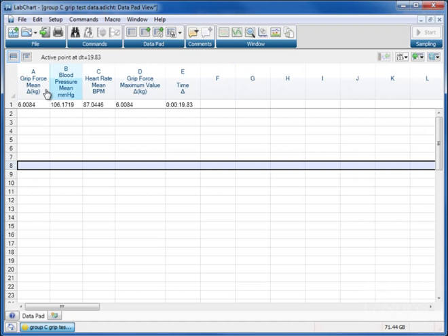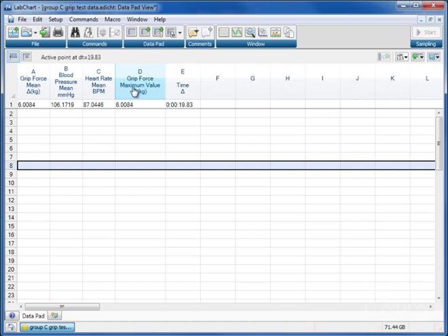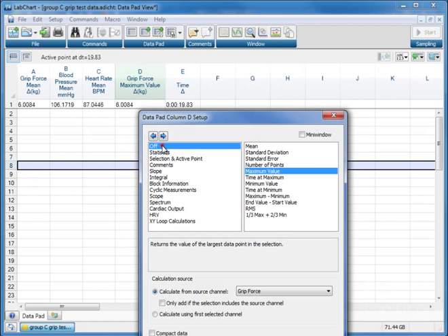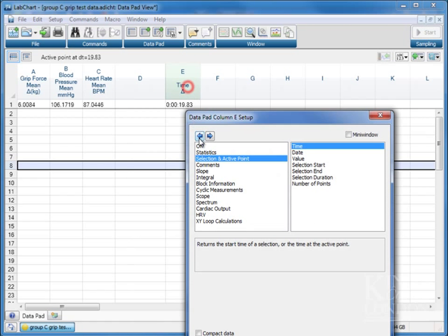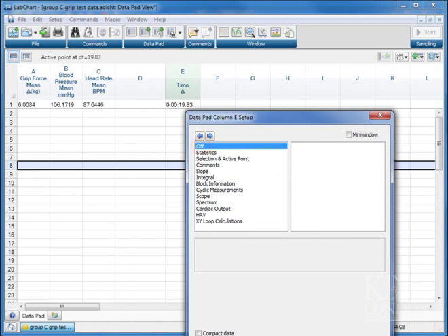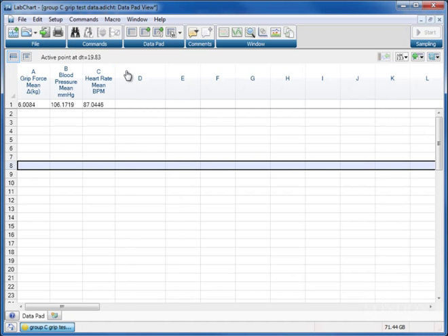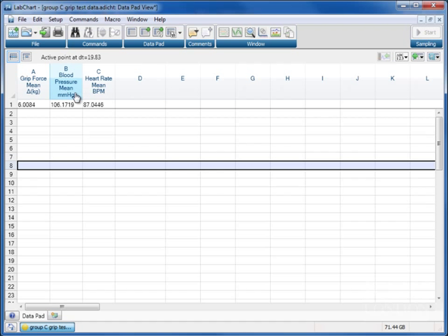This example we've got set up to show grip force, blood pressure, heart rate means, so averages over a selection period. Also this has got a grip force maximum and time maximum. I'm going to close those and show you how you do them because those are the ones that I've added myself in this data set. So we've got grip force, blood pressure, and heart rate.